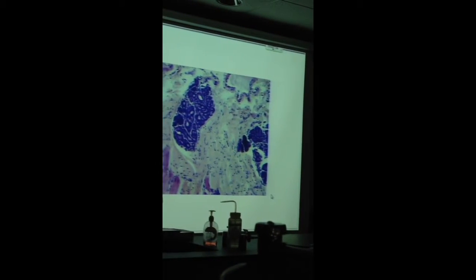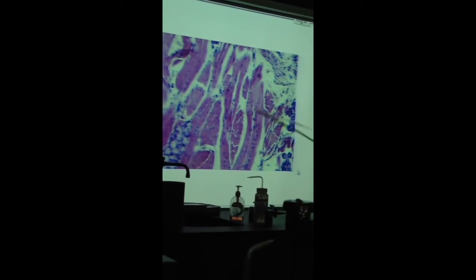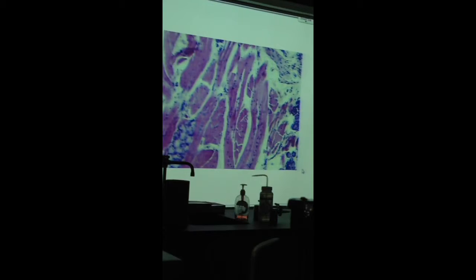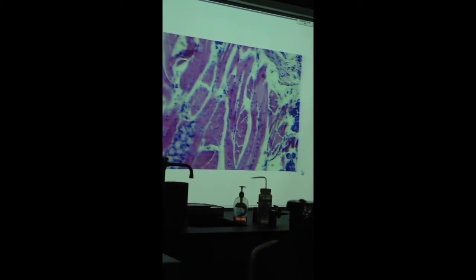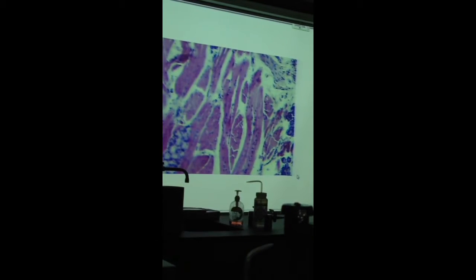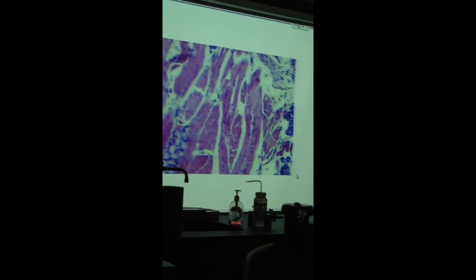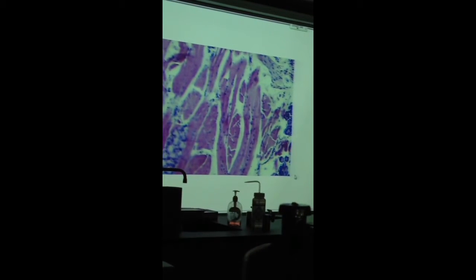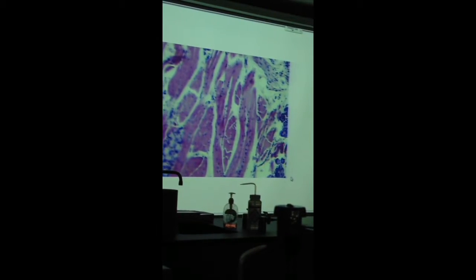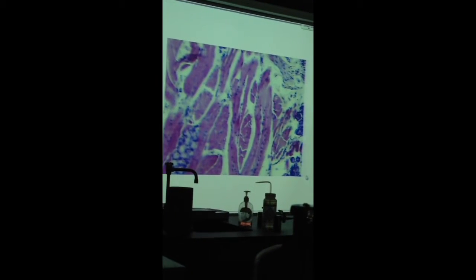Something else we see here, this red stuff here. What is this? Dark things are nuclei. What's a tongue full of? Some people eat it. Okay? Anyway, it's muscle. Your tongue, you've got a lot of movement with your tongue.